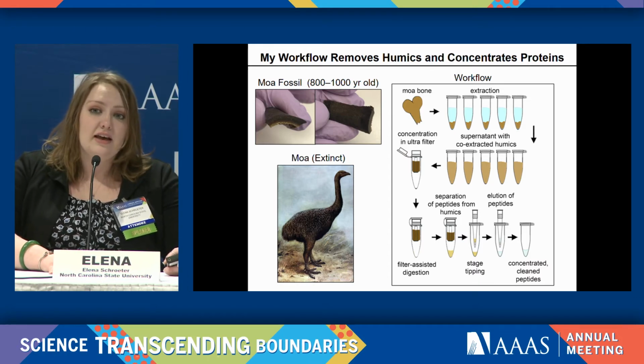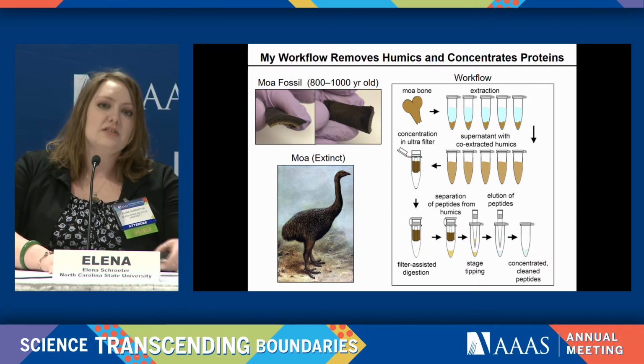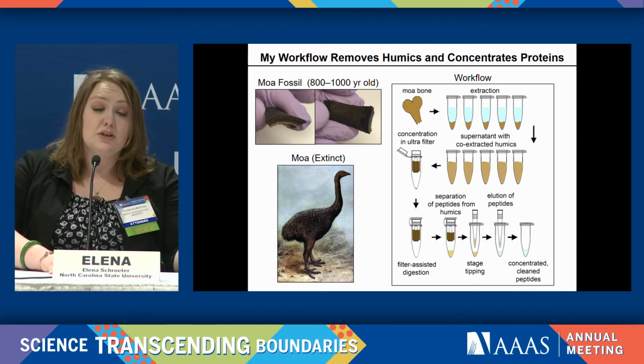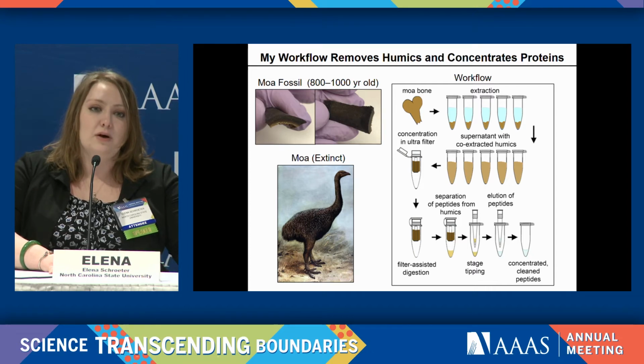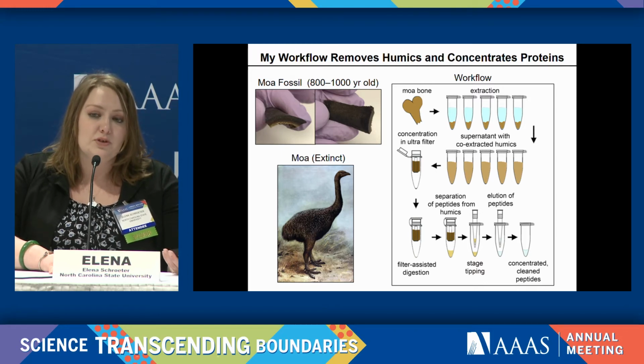The workflow that I developed uses a couple of innovations that especially a lot of others had also contributed to: extraction methods to take multiple aliquots of bone, take a lot of extract from a lot of bone, concentrate it into a small volume, and then remove those humic substances.